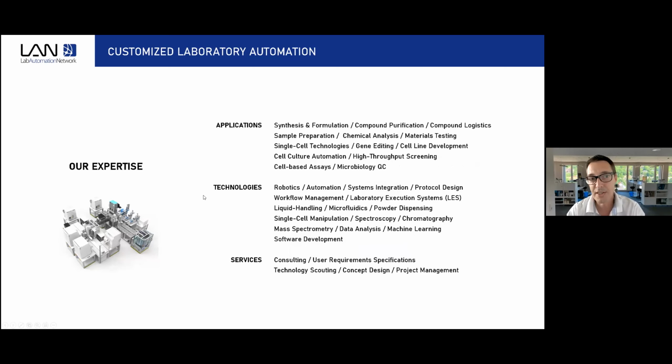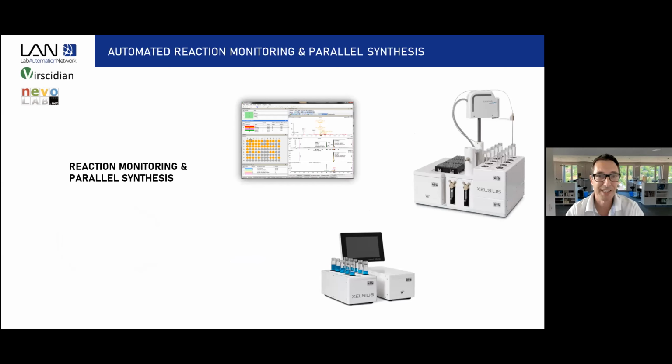So these are the applications that we typically work with, and the first step here is synthesis and formulation, and reaction monitoring is part of that. The technologies we use are not only robotics, but also laboratory instrumentation, software, analytical technologies, and many more. All right, so let's step into the topic of today, reaction monitoring and parallel synthesis. And our first speaker for today is Mark Spears, and I'd like to hand over to Mark now. Please, Mark, the stage is yours.